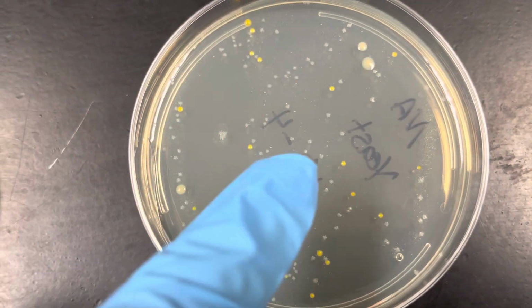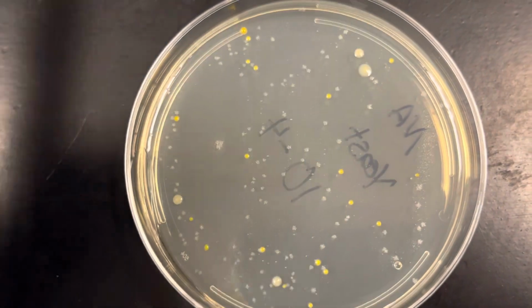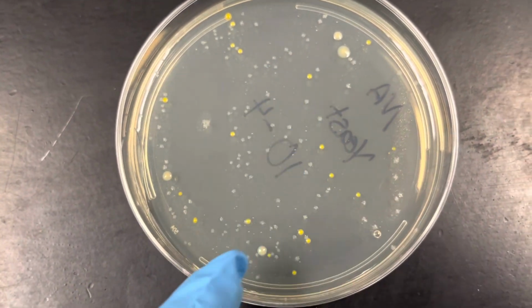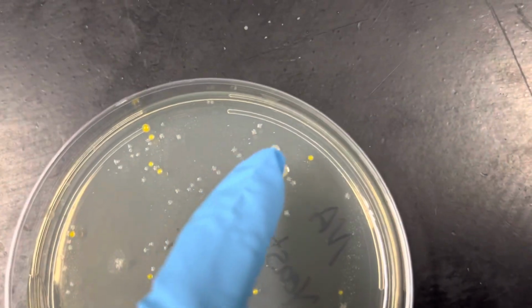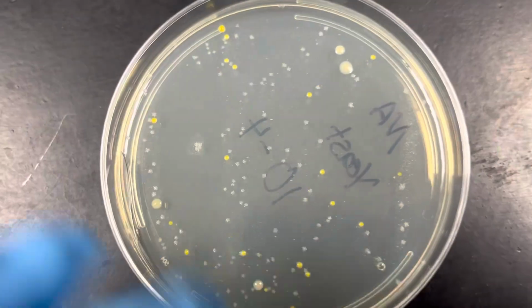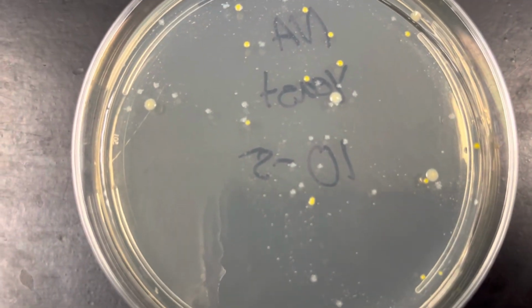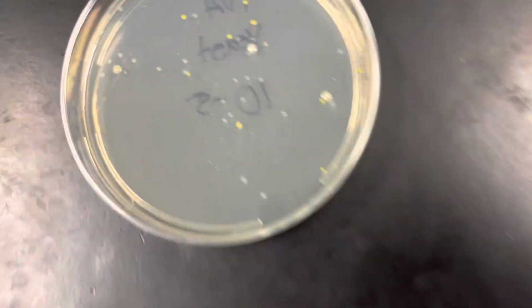Now you could actually count these, right? 1, 2, 3, 4, 5, 6, etc. Again, only count the yeast colonies. Don't count the bright yellows or white or these bigger egg-looking ones. Just the yeast. So it should give you a better idea now. Again, the yeast is lighter and harder to see. Only count those. This one is countable.